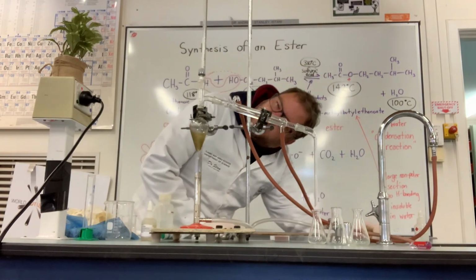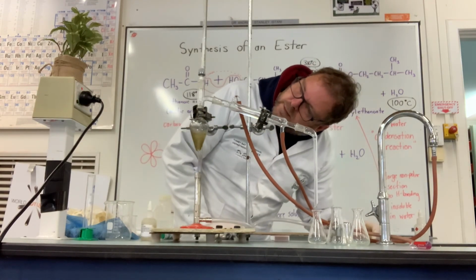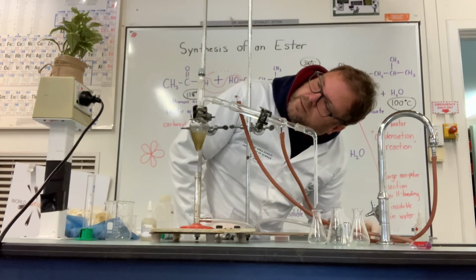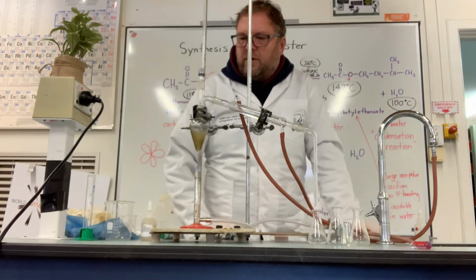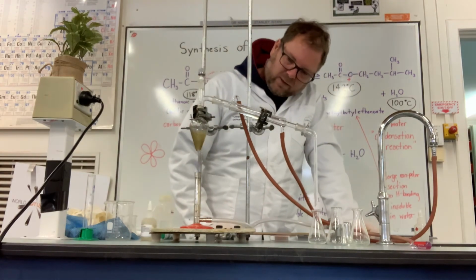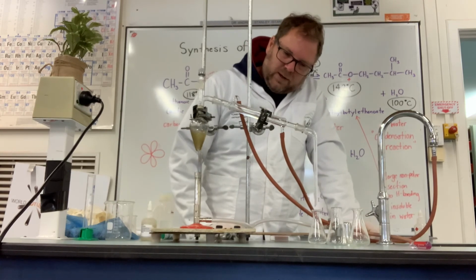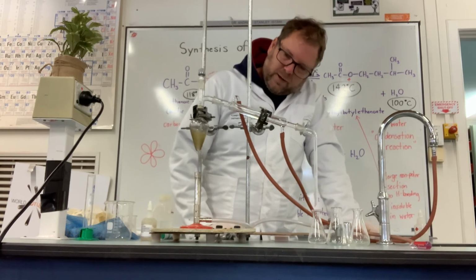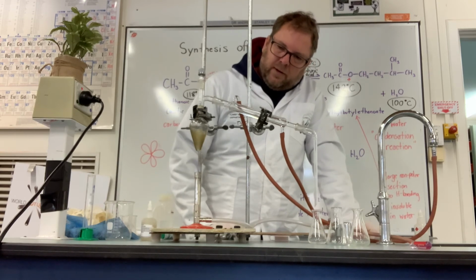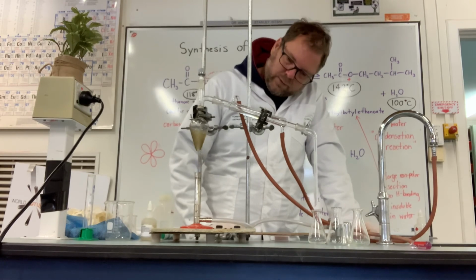And if we have a look, the temperature there is, so it's only showing about 80 degrees at the moment, but sometimes there is a bit of lag in that thermometer. So let's just see what happens. In an ideal distillation, we will see that the first thing comes across, and then we'll almost see a pause as everything at that temperature boils off, and then the next layer will come across.